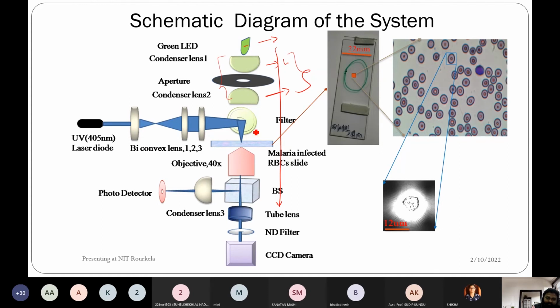This slide is focused on a microscopic slide, prepared in such a way that single cells are clearly visible and well separated from each other.